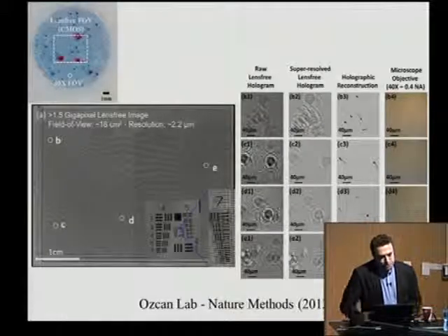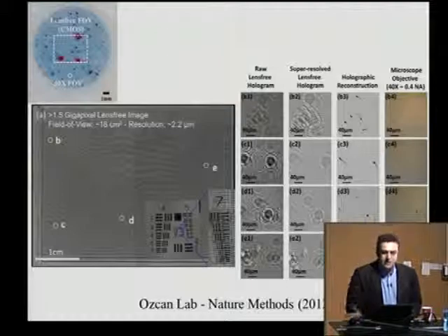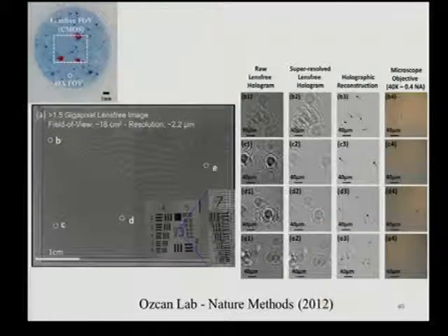So far, I've been focusing on CMOS imagers, all of which are being used in our mobile phone cameras. And this is the signature over here, a scale bar of 1 millimeter and half a centimeter by half a centimeter, typical field of view. That is the signature of a CMOS of a mobile phone.